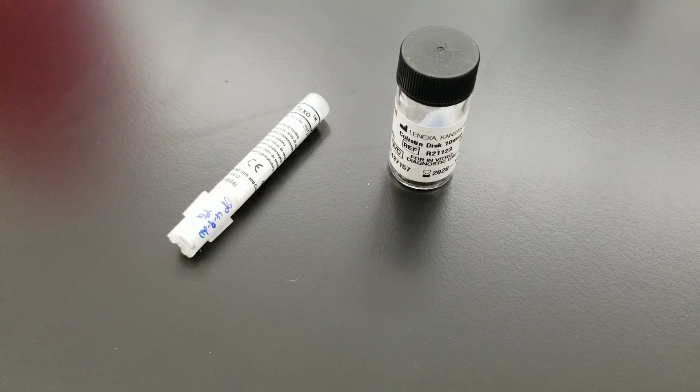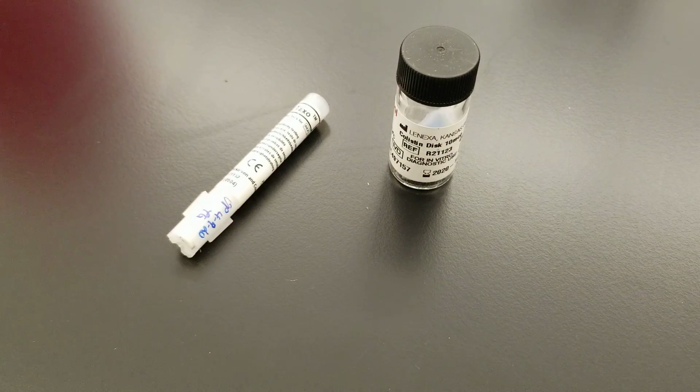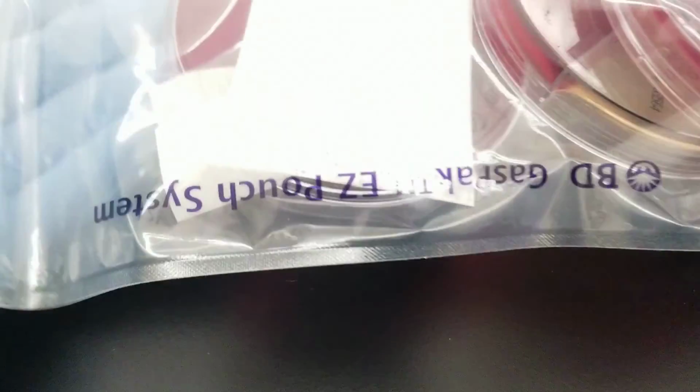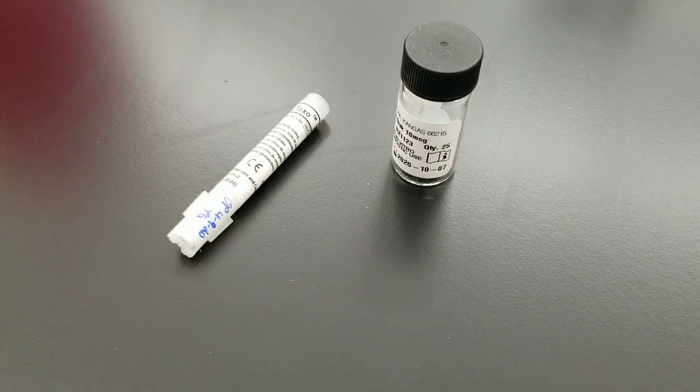And so when we look at why we would do the aerotolerance test, it's because anaerobes usually are present in mixed cultures. That means that once you've grown the specimen on a primary setup with the blood, chocolate, McConkey, and also the anaerobic setup that we've done, and you've seen videos on, there may be growth all throughout.